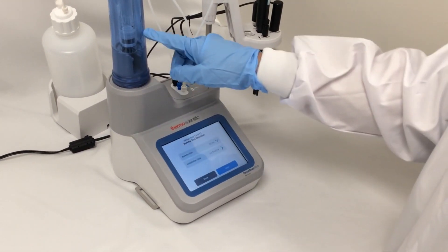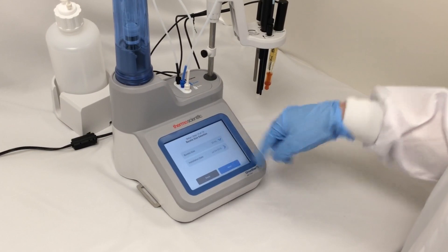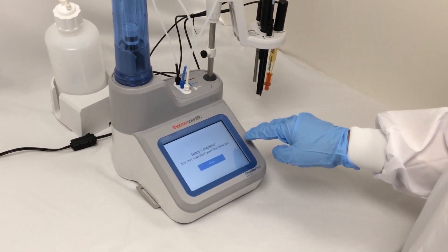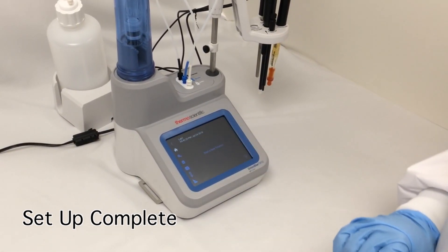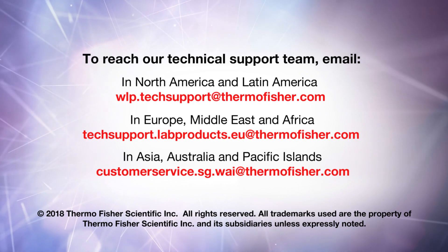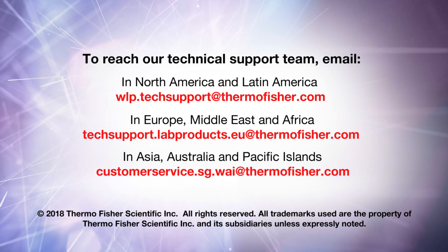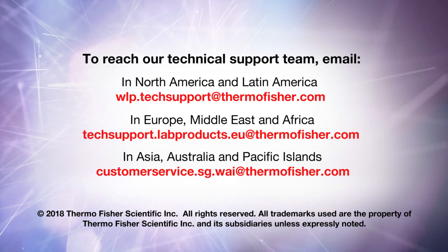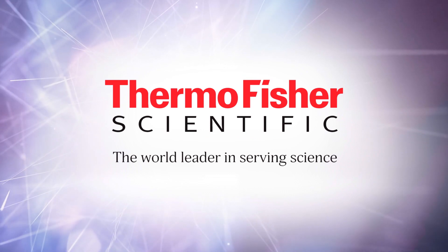I'm also going to verify that I have a 20 milliliter burette. And if I want to, I can save an installation date and use a maintenance reminder later. That completes my titration setup wizard — I'm done and it's going to go to the home screen.